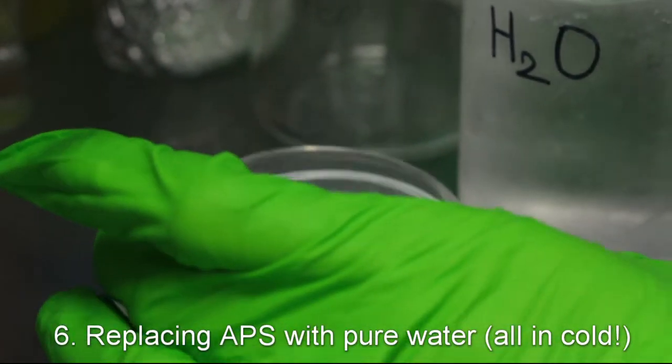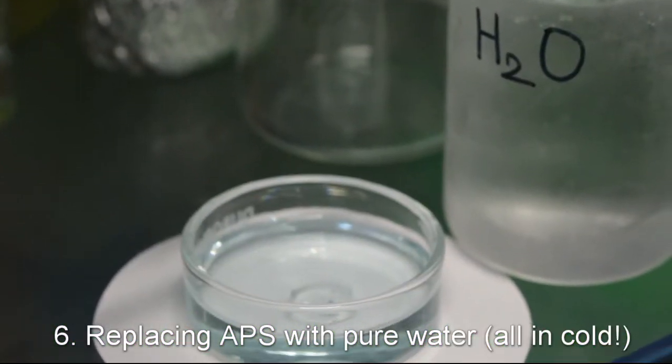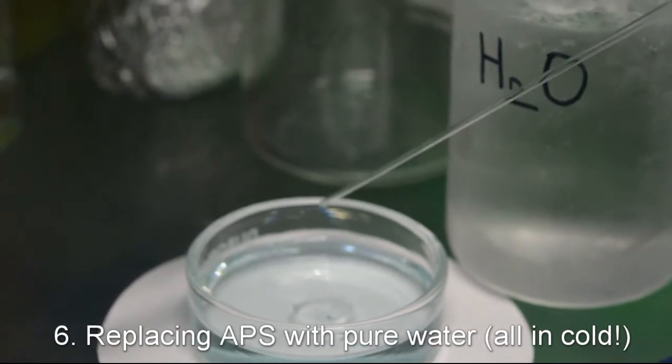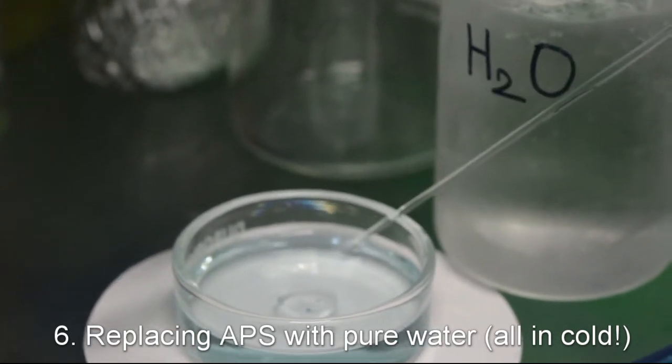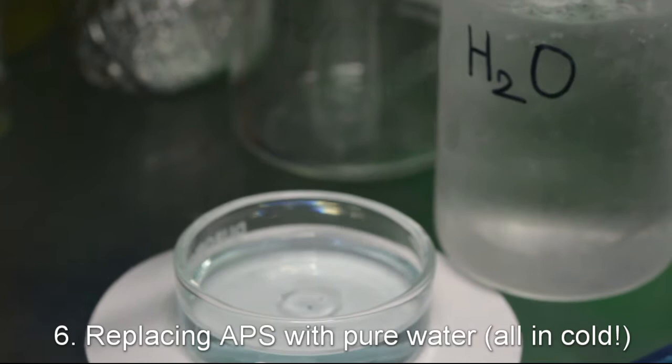After copper is fully etched, we replace the ammonium persulfate solution with pure water that we cooled down previously in order not to have salt crystals on graphene surface.